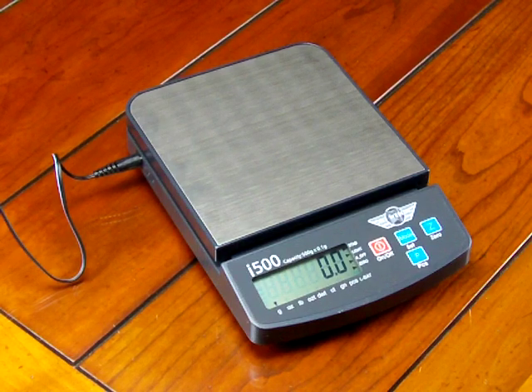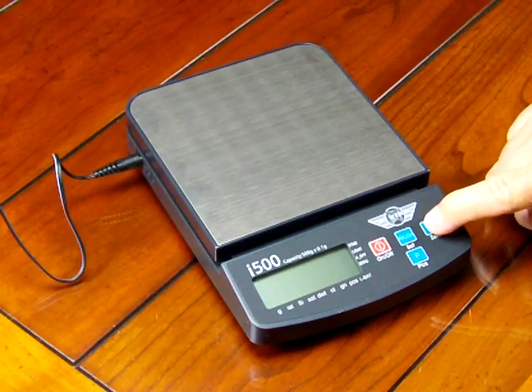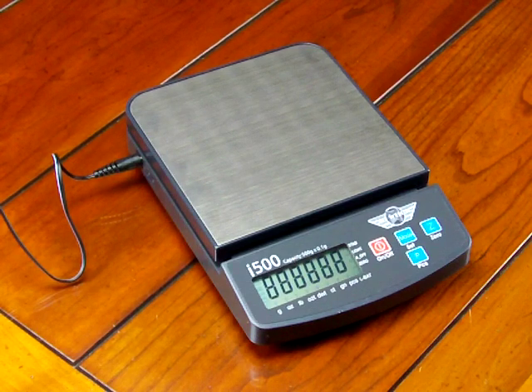The first thing you need to do to perform calibration is shut off the scale. Then press the zero button and hold it down while turning on the power button, then release. So now I release.